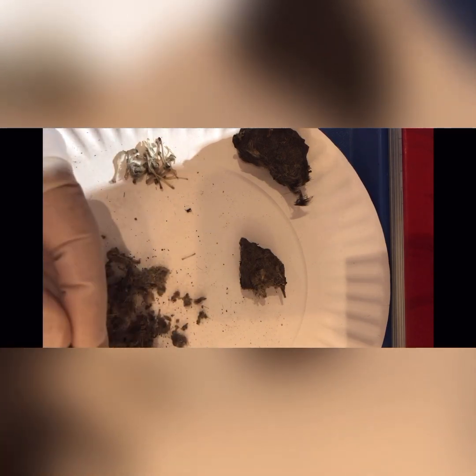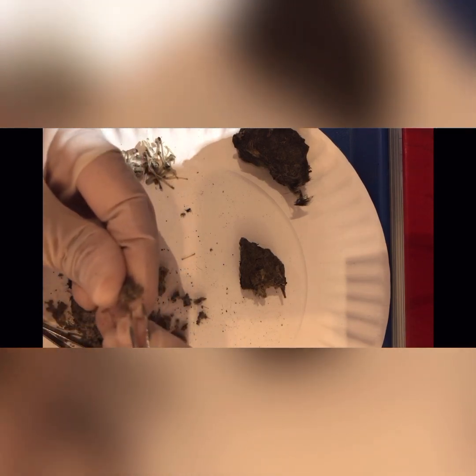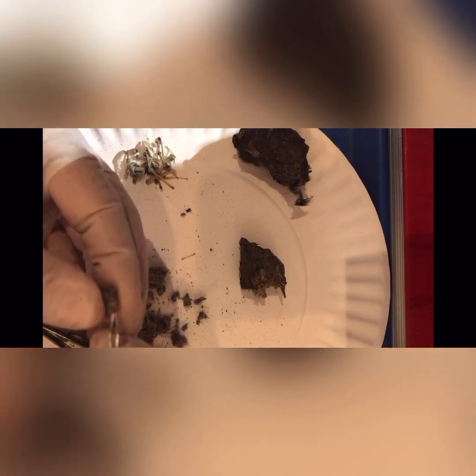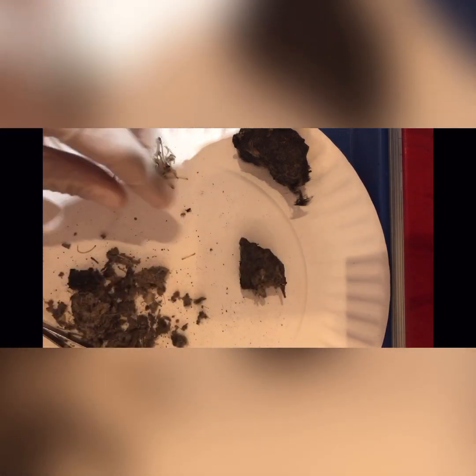And you might find more than one animal in here. Depends on if your owl was hungry that night or if it wasn't. Actually, the young will eat more than the parents because they are growing. So if the pellet is bigger, it might actually belong to a younger owl.